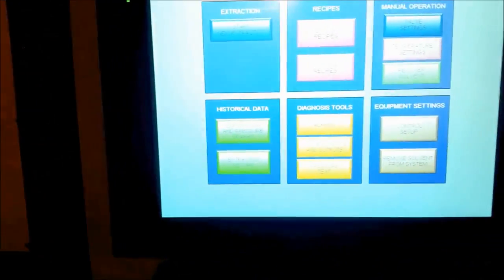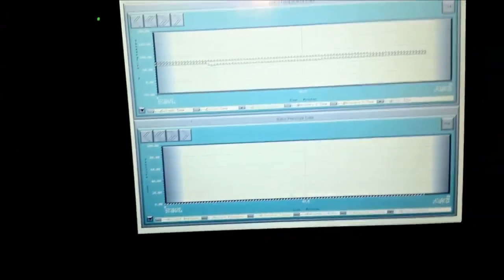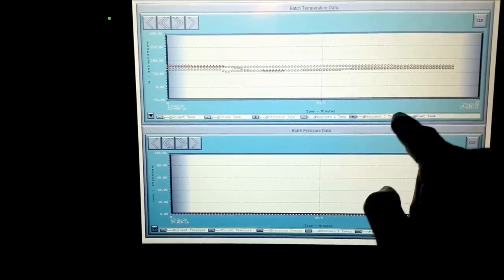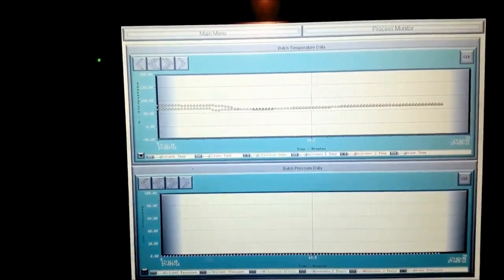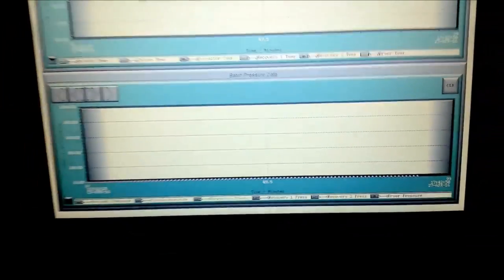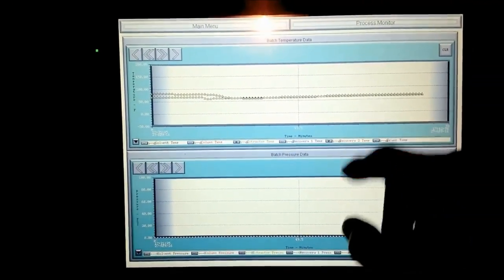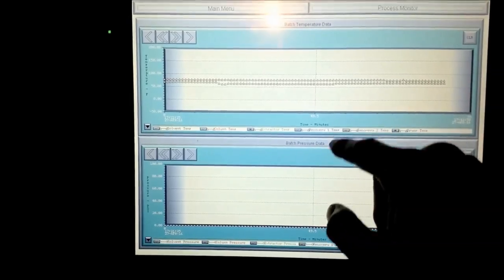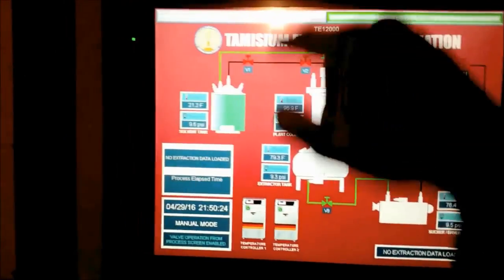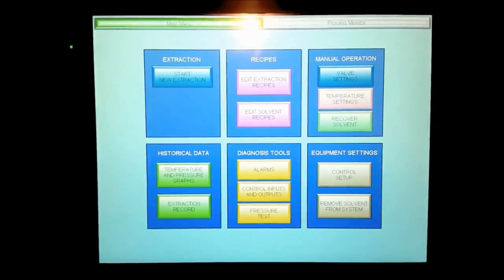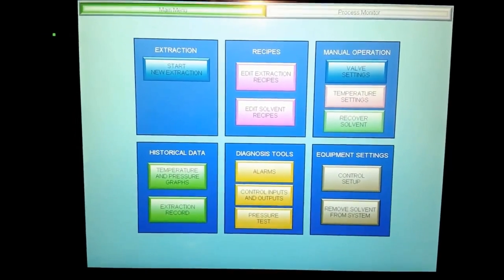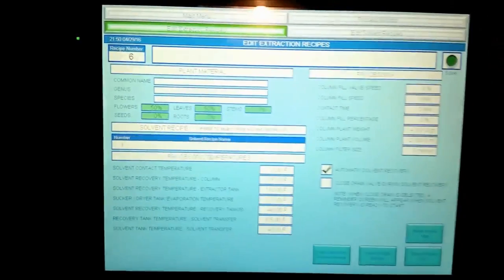Anytime you want to see pressures, you can turn each one of the tanks on, look at the pressures, the temperatures individually. Clear your alarms from pressure test, edit your extraction recipe.